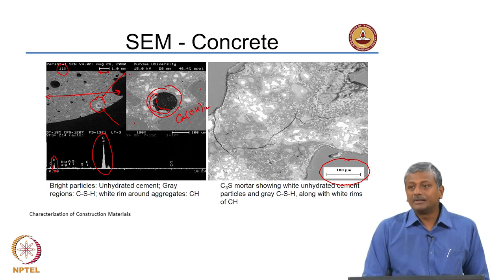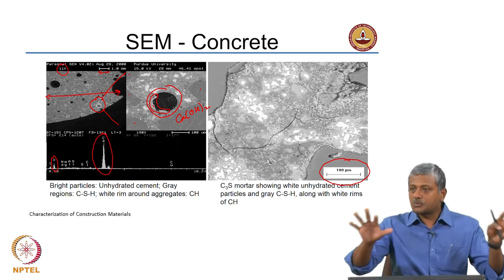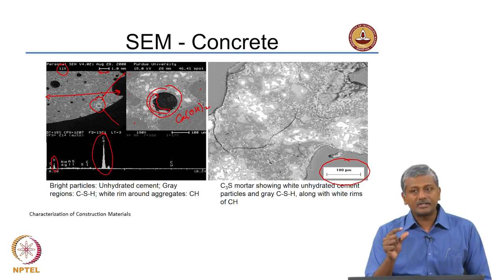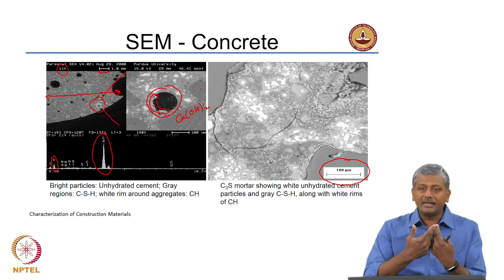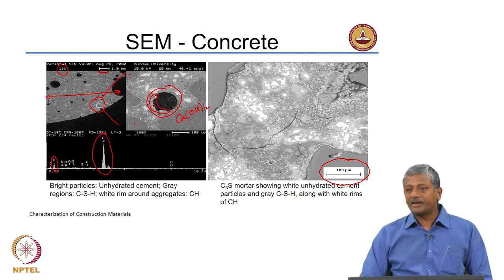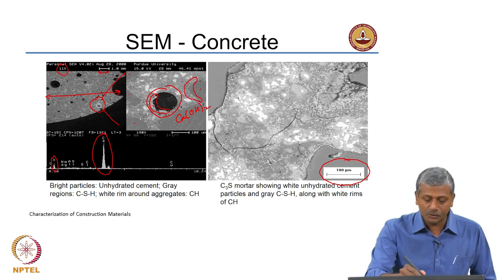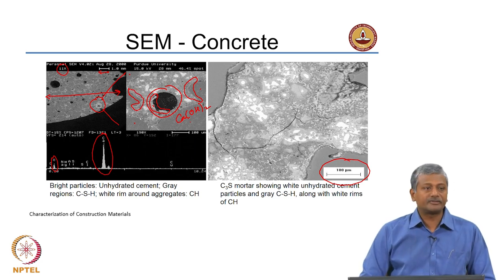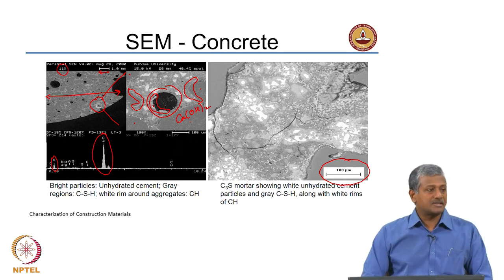In most literature, calcium hydroxide in cement paste is typically found mixed with the outer CSH. However, because the interfaces between the aggregate and paste as well as the voids provide a large enough area, this highly crystalline phase can grow and nucleate to a much larger size. That is why you find air voids typically lined with calcium hydroxide. If you look closely at the aggregate interface, you also see a whitish layer forming — there is indeed large evidence that calcium hydroxide grows in the spaces next to the aggregate.